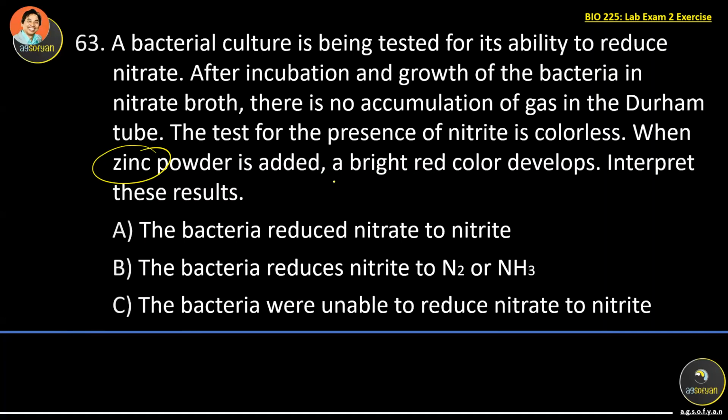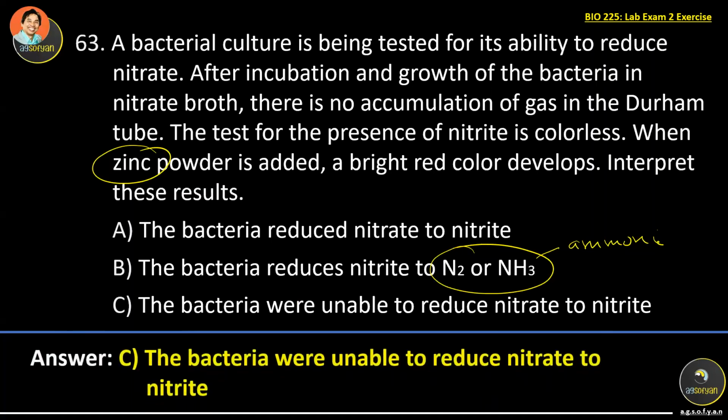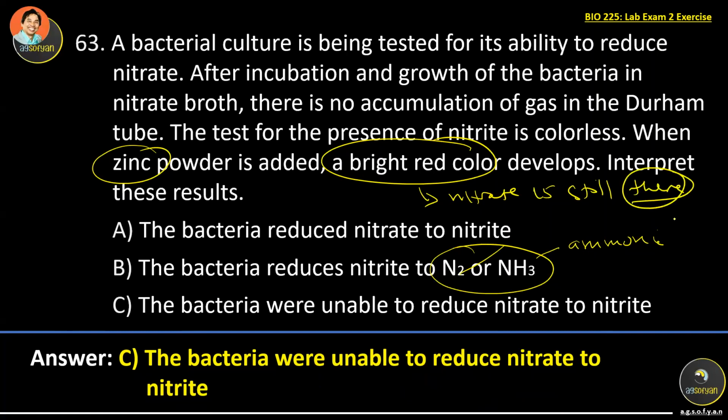The bright red color means the nitrate is still there, so the bacteria did not reduce the nitrate.